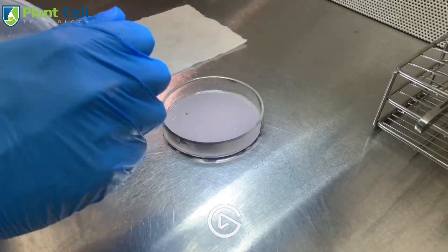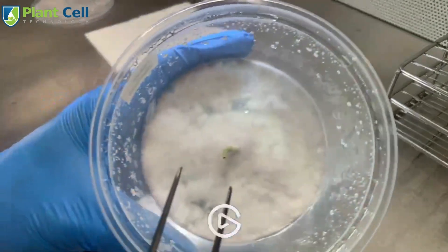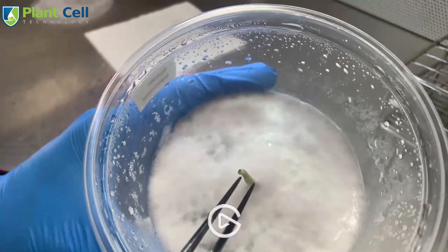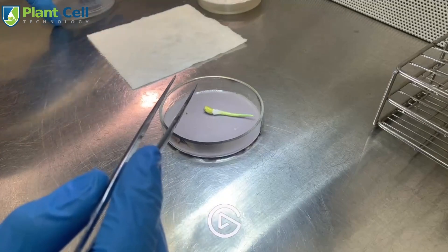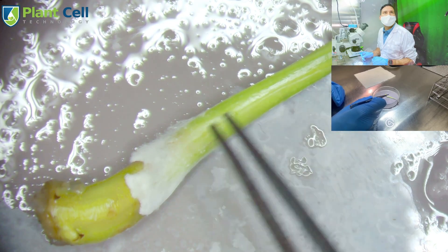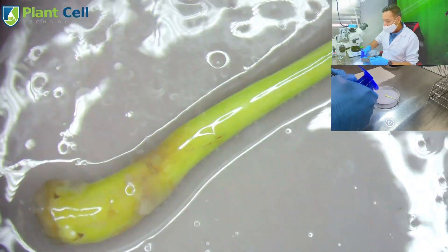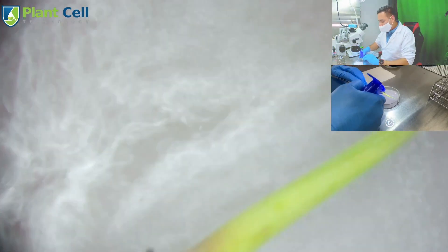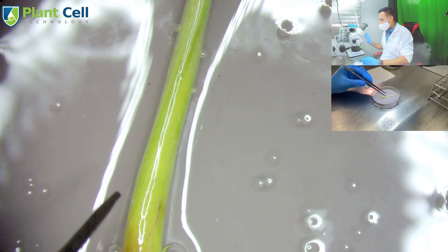Let me take the plant out and give you a better close-up. You can see how contaminated it is — this happened super fast, very aggressive contamination. I just need to carry all of this and I want to use 70% isopropyl alcohol. I'll just spray the plant with alcohol, that's all I'm going to use.